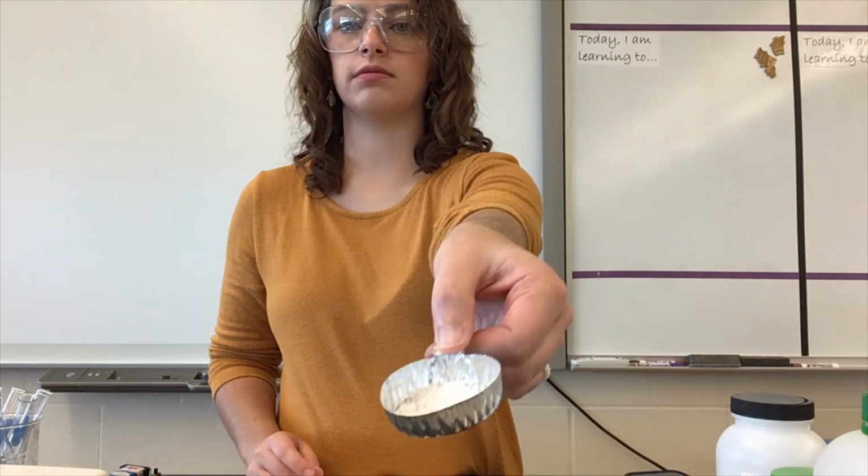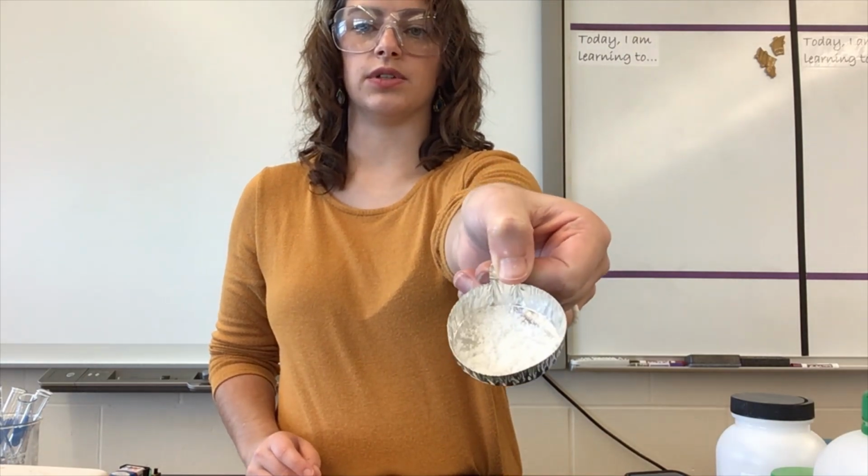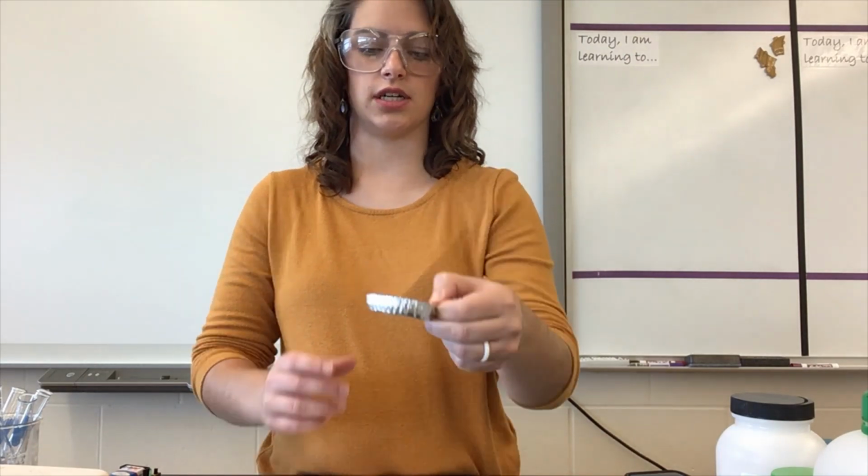Okay, so here we are. I don't know if you can really see, it's kind of sparkly. Let's see if I can get it in a picture.